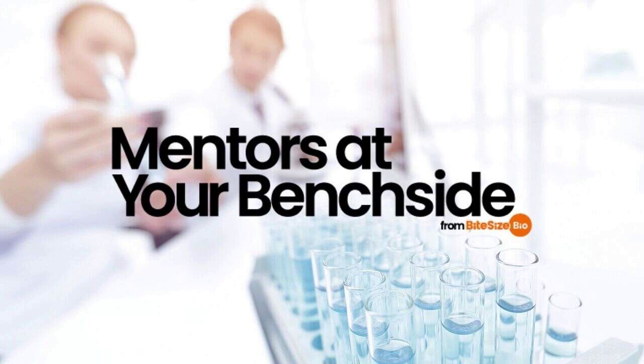I'm Adam Pawson, and today I'll be talking to you about quantitative PCR primer design. Primer design is a critical step when setting up your qPCR or RT-qPCR for gene expression analysis. qPCR primers that anneal poorly or that anneal to more than one sequence during amplification can significantly impact the quality and reliability of your results.